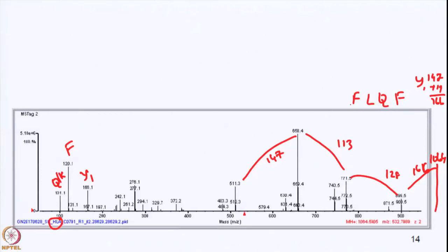These would be Y ions, no, that would be B ions. This is 28, right? It's a B ion, 28. BI. What else can we do here? That's again 28.